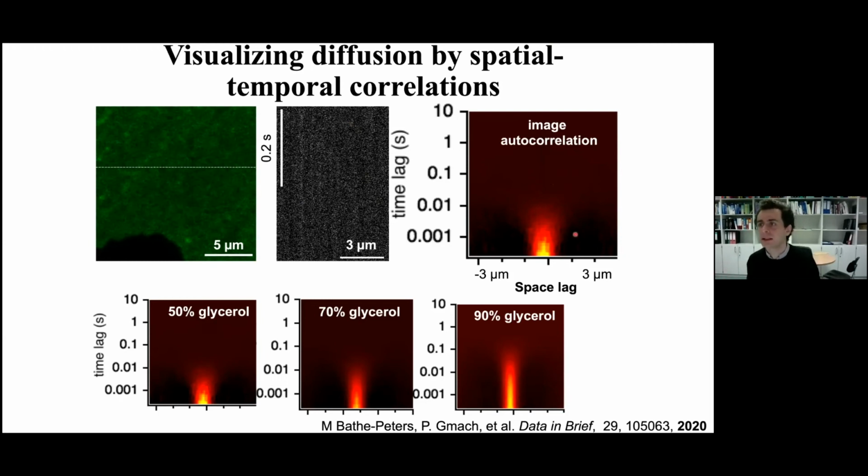It doesn't matter. What you are basically seeing here is the drop of dye, which is broadening up in your glass, even though you are extracting this information from an equilibrium situation. So there is no dye here, or no molecules in one point that then broaden up. But statistically, you can extract exactly this type of information. So at time 0, this axis is time and it's logarithmic, all your molecules start here.